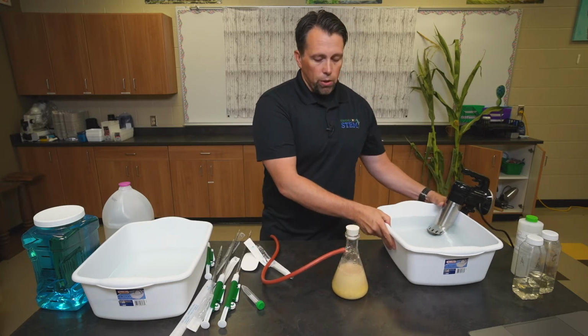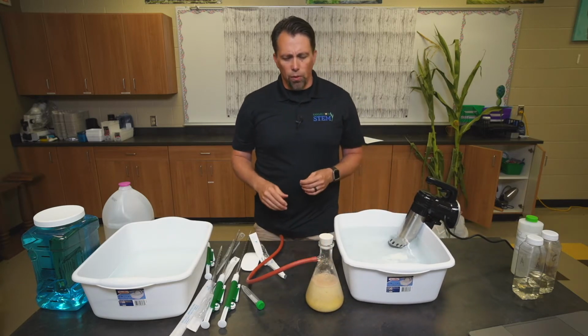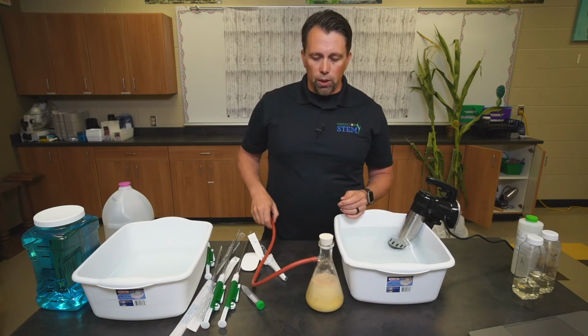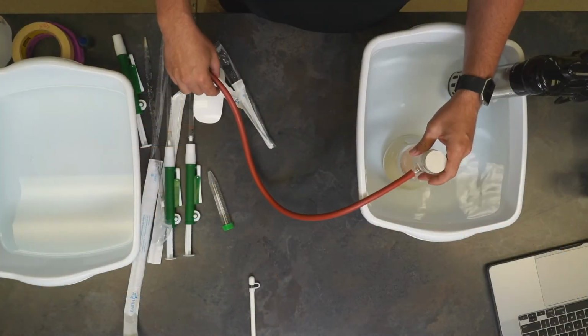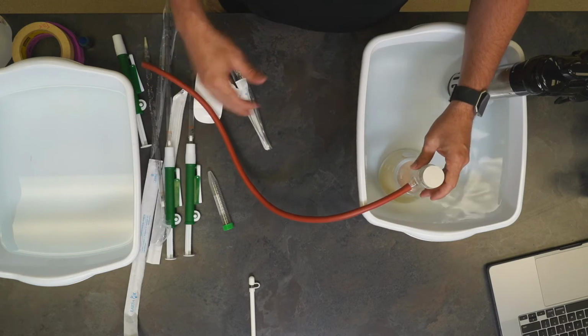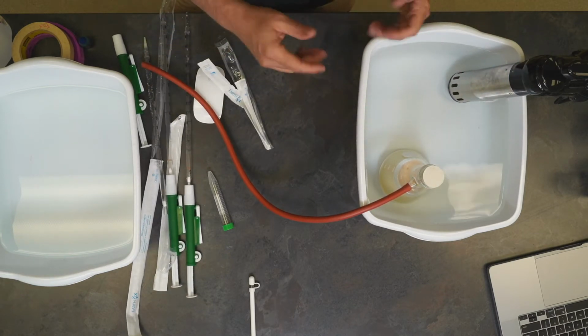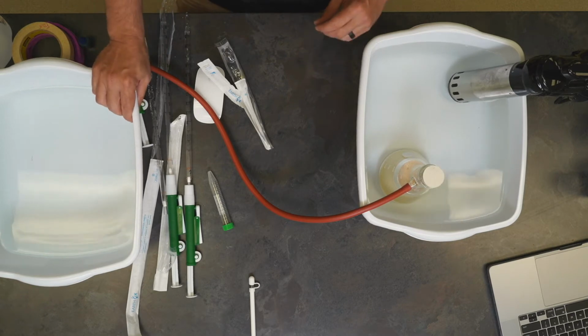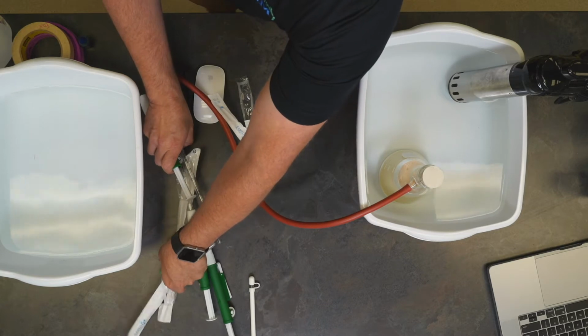A lot of times they want to adjust the temperature. They've decided, and most of the times we run this, somewhere around 38 degrees Celsius, maybe 40 degrees Celsius. So we put this in the warm water bath with a sous vide, and if more than one student group wants to run the same temperature, they can use the same water bath. Get these out of the way now.